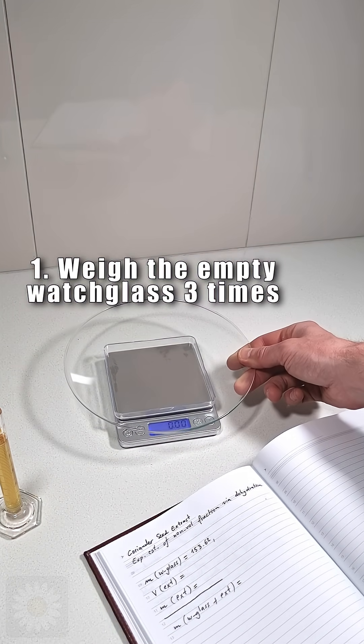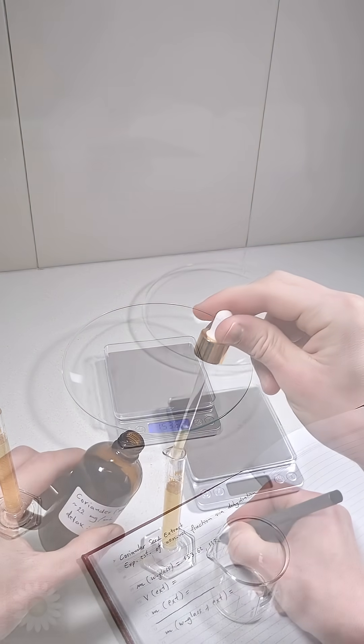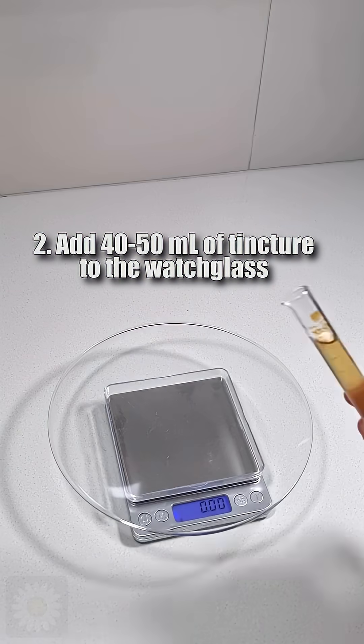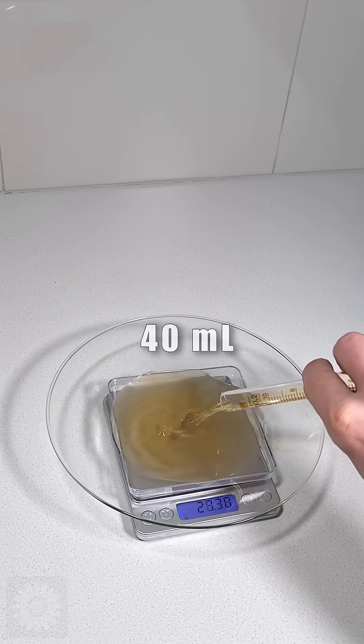First, weigh the empty glass three times, note the masses, and find the average. Next, add 40 or 50 milliliters of tincture to the glass, measure it carefully, and write it down. In this example, we used 40 milliliters.